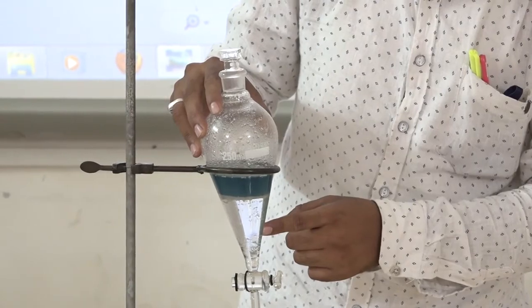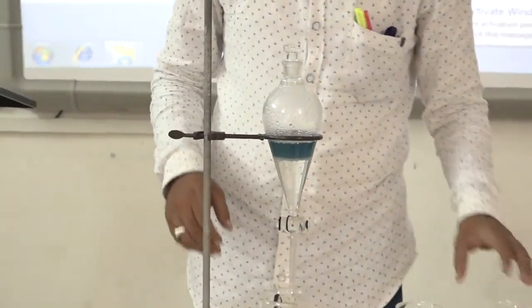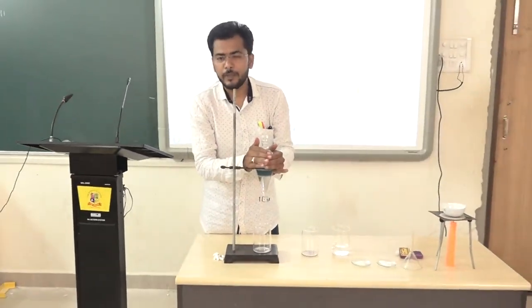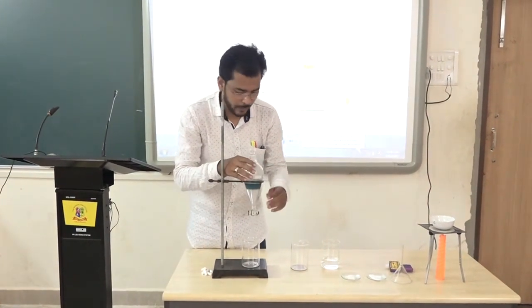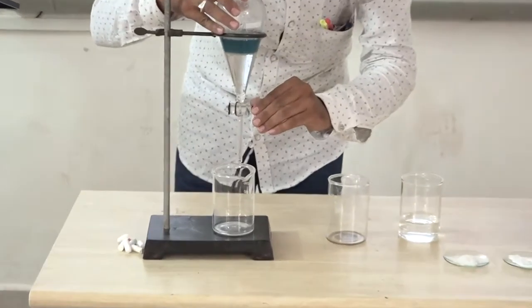I hope that you are understanding. So now we will separate them. This separating funnel is used to separate these two immiscible liquids of different densities. So what will happen? The lower layer will be collected into another beaker.